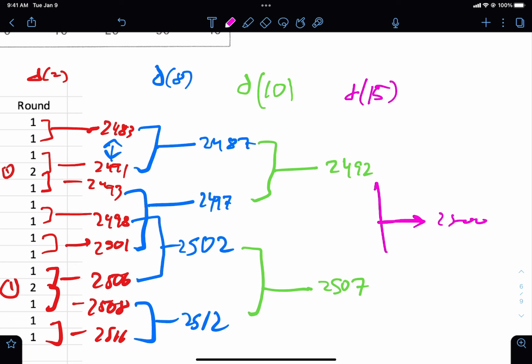So think about what that means in terms of the structure. Okay, it's a single type of proton that has 4 neighbors. There are 4 single neighbors, and the relationship from that hydrogen is different to all of its neighbors. So it's like the hydrogen to a red neighbor, a hydrogen to an orange neighbor, a hydrogen to a green neighbor, and a hydrogen to a blue neighbor. 4 neighbors, and the relationship is different to each of them. That would give you a doublet of doublets of doublets of doublets.